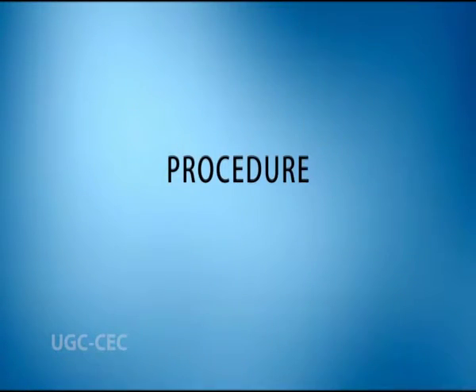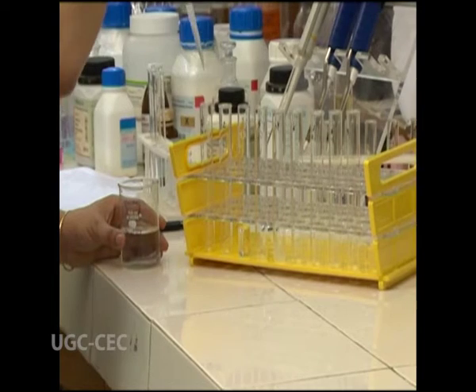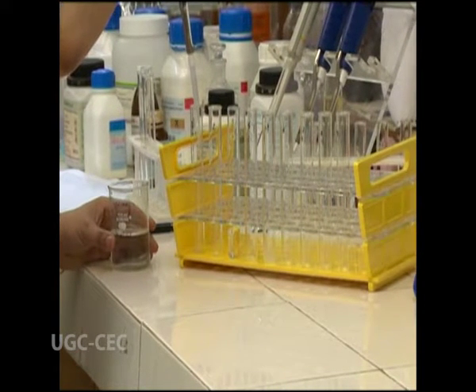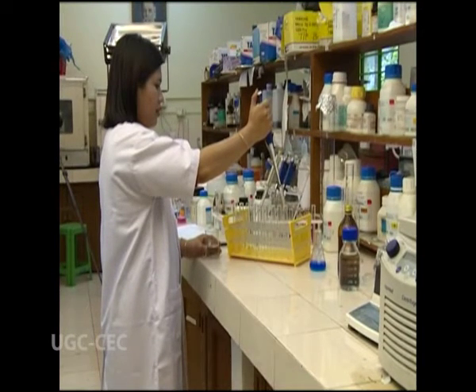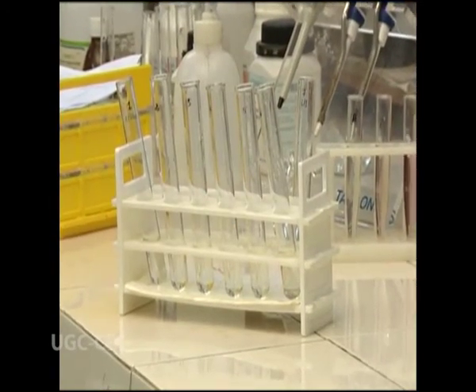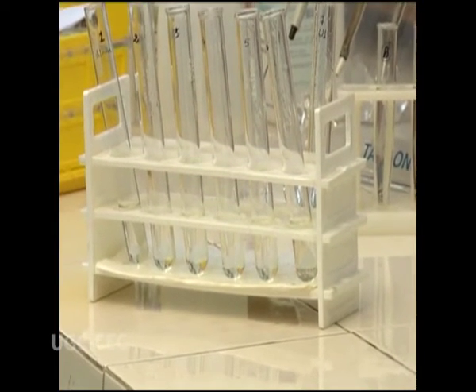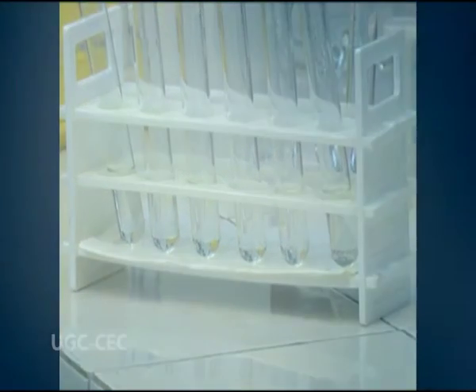Coming to the procedure. Aliquots of the standard glucose solution, 100 microgram per ml, are pipetted out in a series of test tubes as 0.2 ml, 0.4 ml, 0.6 ml, 0.8 ml and 1 ml. The volume in each test tube is made up to 2 ml with distilled water. Then, a blank is also prepared containing 2 ml of distilled water.